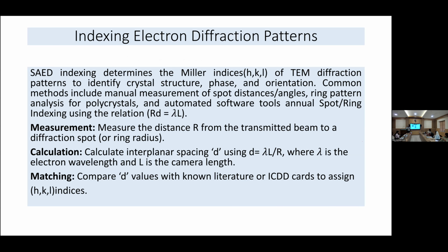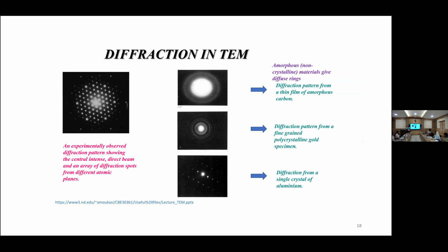Yeah, that is just for comparison, like single crystal, polycrystalline, and amorphous. That is like different crystals. For different crystals, different planes will be there. So depending on the planes, the pattern will be different. For different materials, we will get different patterns. That's the thing.